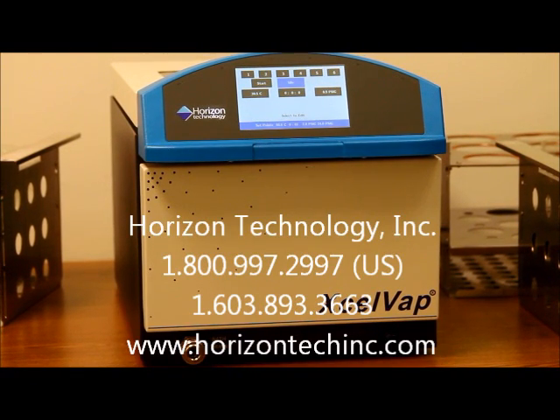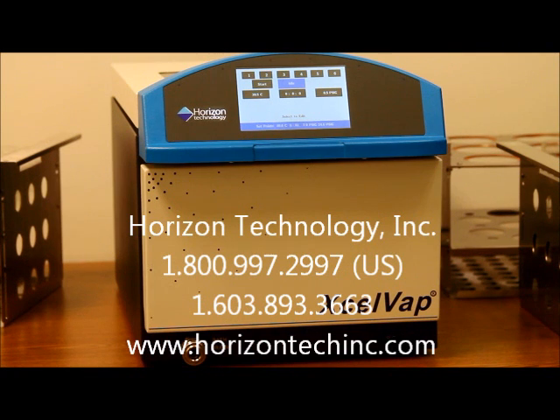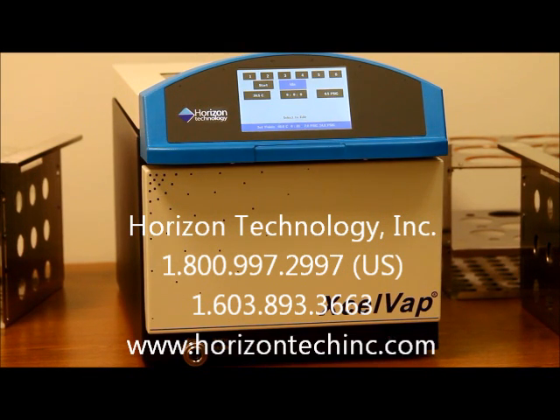Try the ExcelVap system — a companion for every chromatograph. Try the ExcelVap system and prepare for better results.